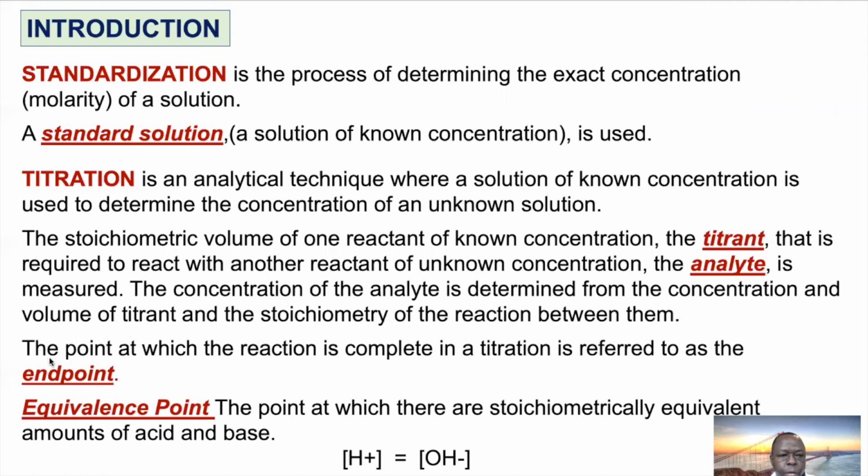Before we get to this, standardization is making sure that we know the exact molarity of the titrant which goes in the burette. Quite often, for example, when you prepare a certain concentration of sodium hydroxide, NaOH, used in titration, the concentration keeps on changing over time. Let's say we make a solution of sodium hydroxide today, and we store it until tomorrow or next week. Over time, the concentration keeps on changing.